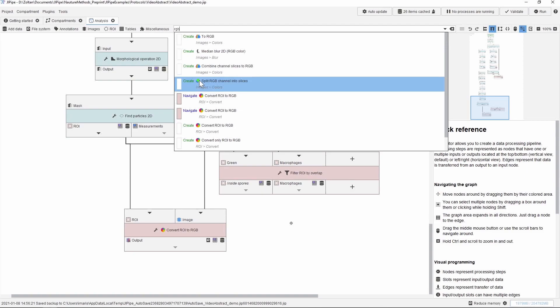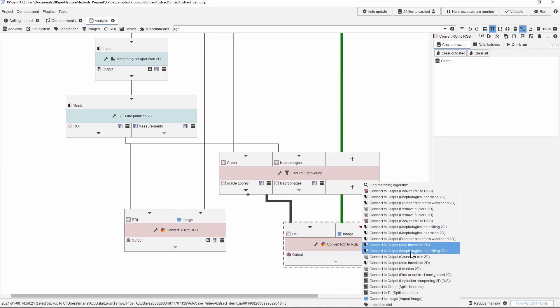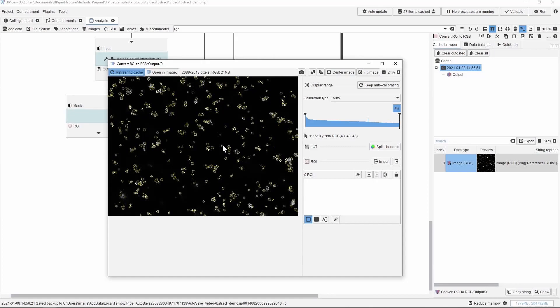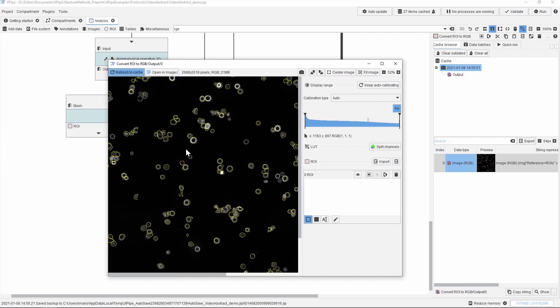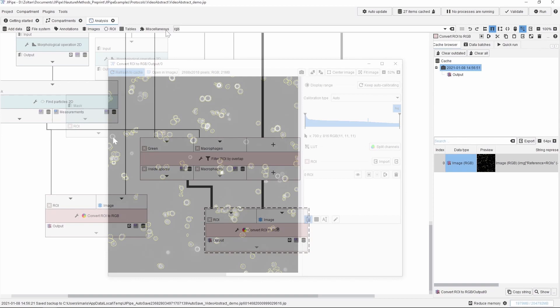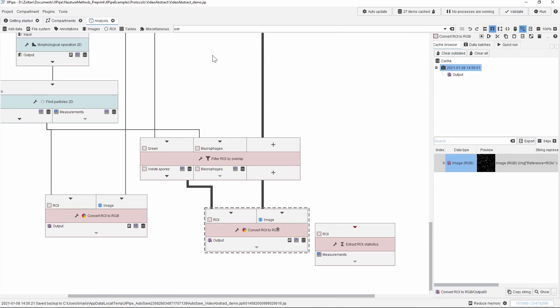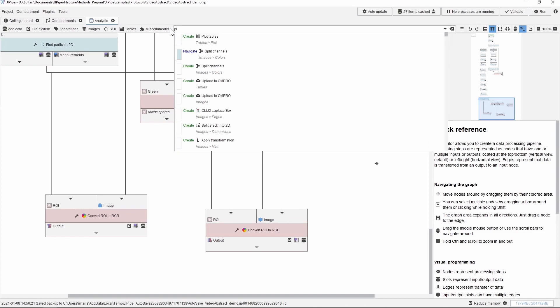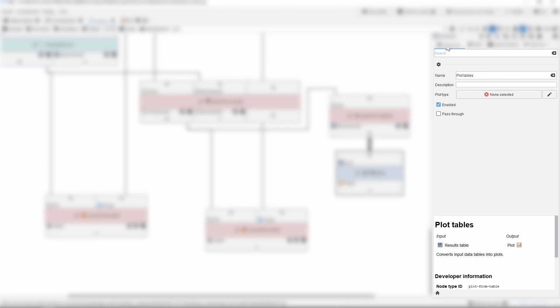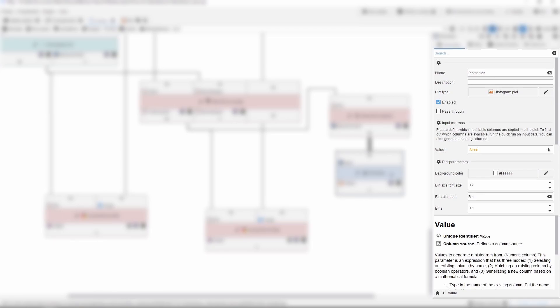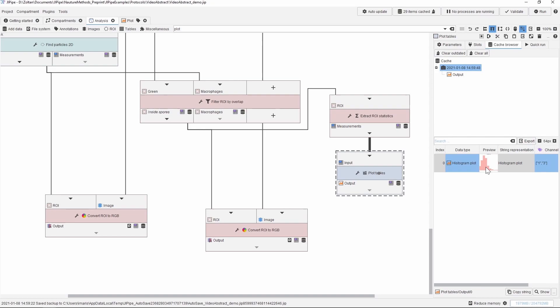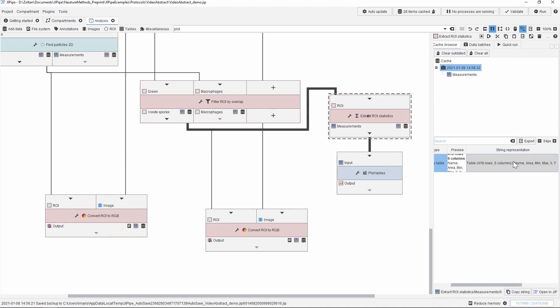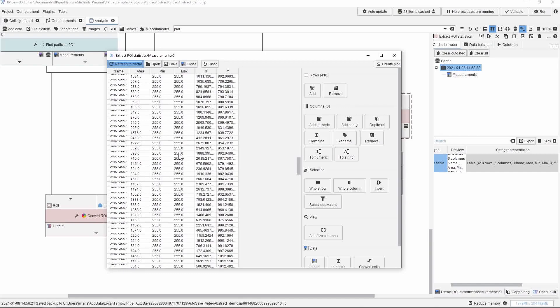After running update cache, we can now clearly see those spores which are not inside macrophages — these are not outlined — versus those which are inside macrophages, they are outlined in yellow. Let us now extract some statistical properties of these regions of interest. There is a special node for that in Jipipe. We will connect this one to the ROI output. Let's also plot some of the statistical results using the plot tables node. We use a histogram plot for the mode, and then we select the area to be plotted. When we click update cache, Jipipe will generate the output, which is a histogram. By selecting the extract ROI node, you will also have access to the output table of the statistical measurements of these spores or macrophages.